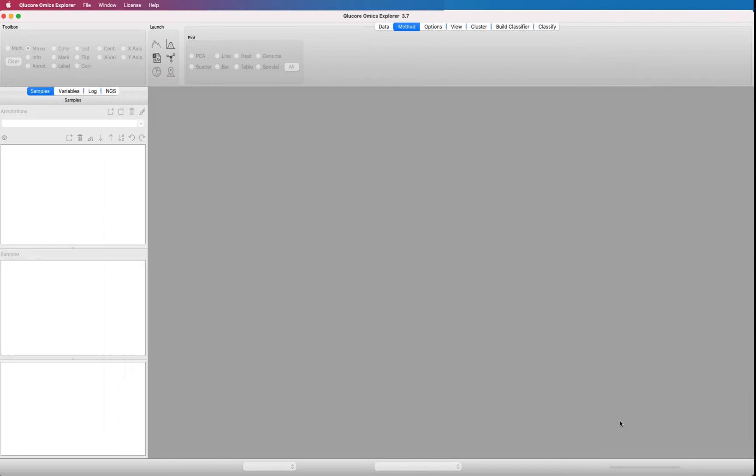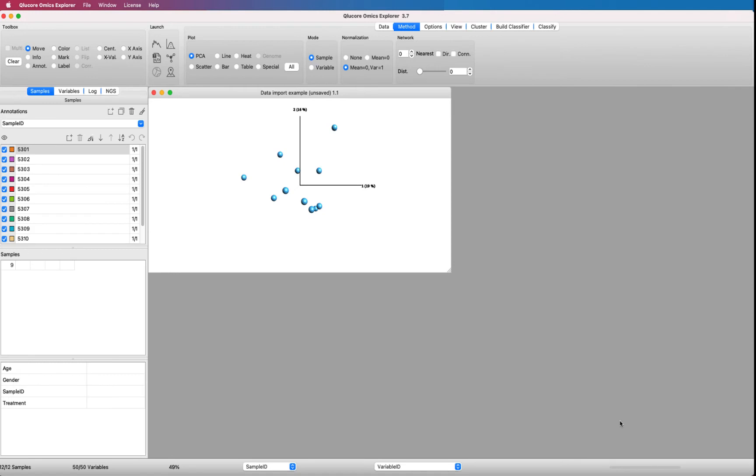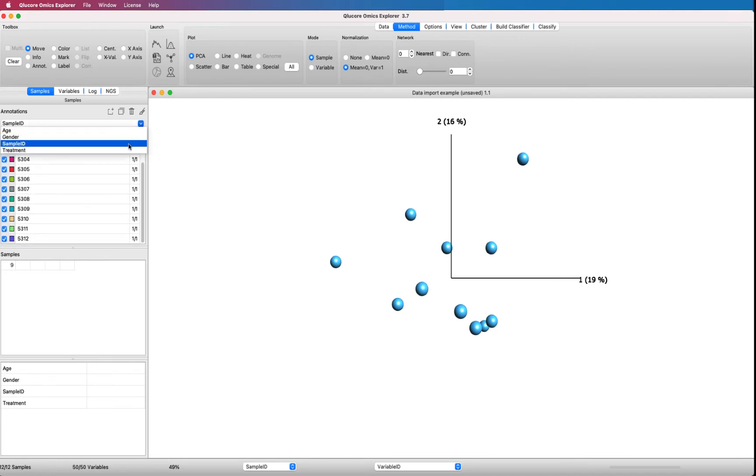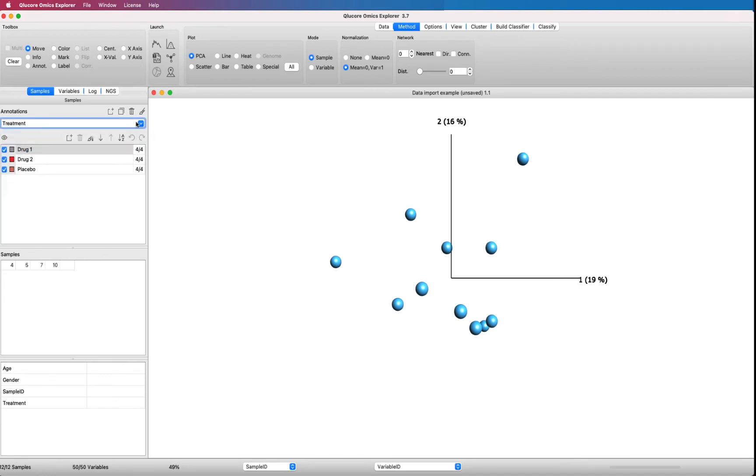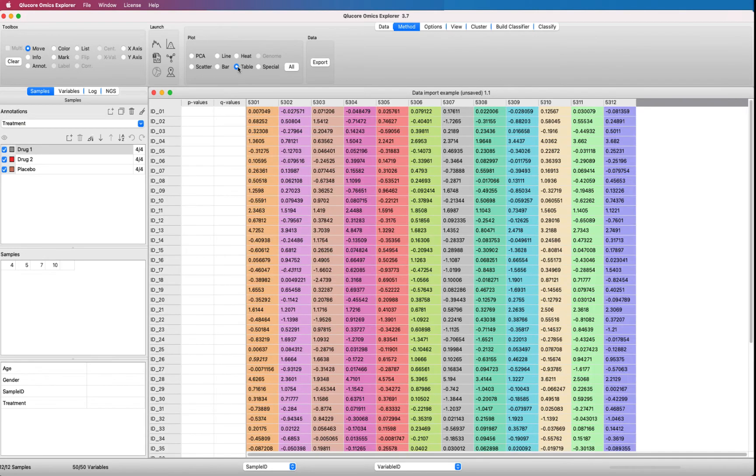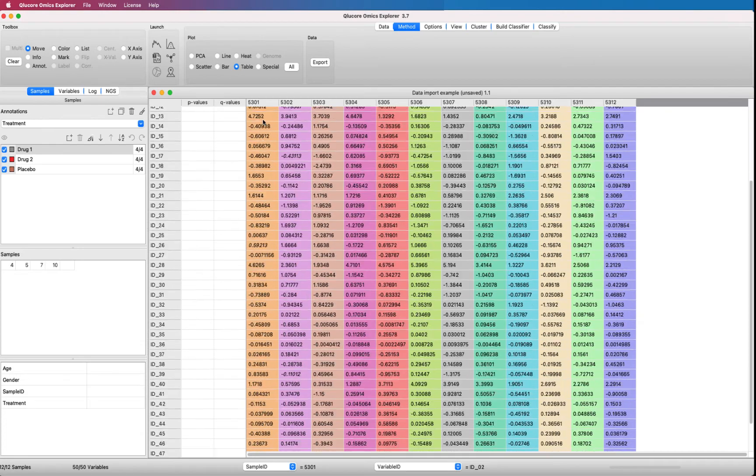The data set opens up as a PCA plot, principal component analysis plot. The data is now ready to be analyzed. Here we see our 12 samples. Here we have the sample annotations that we can use to color our samples. In the table view, we can have a look at the underlying data.